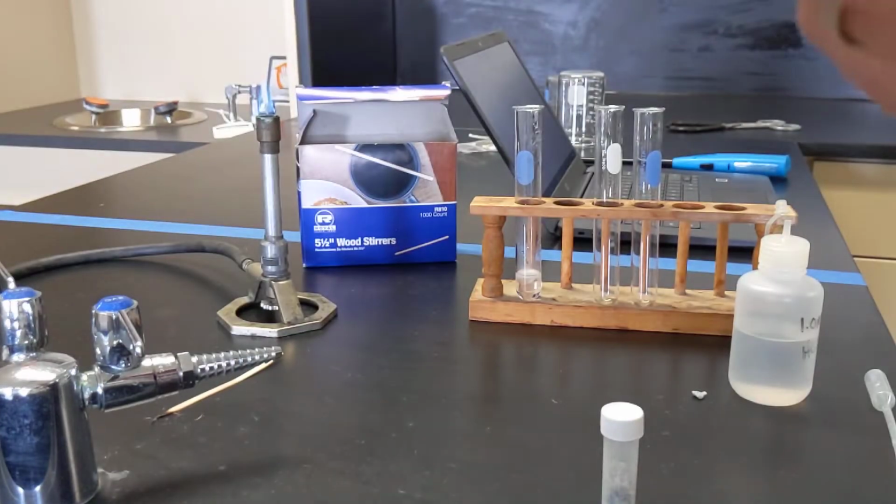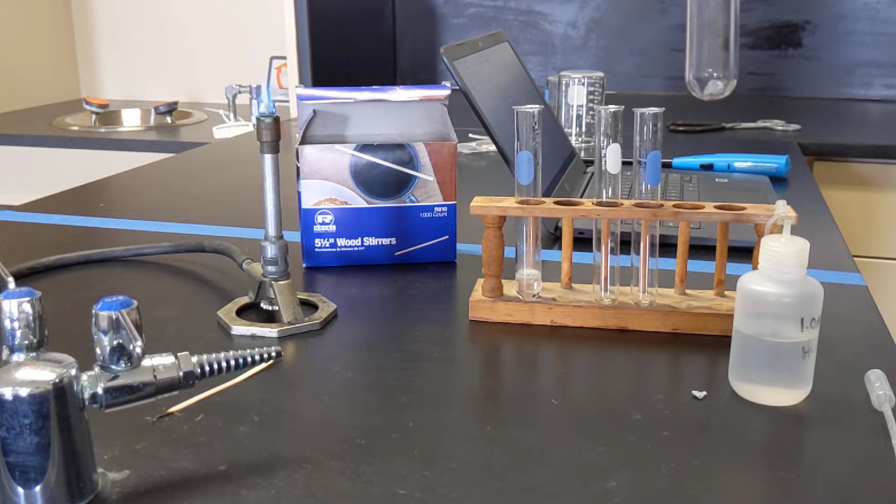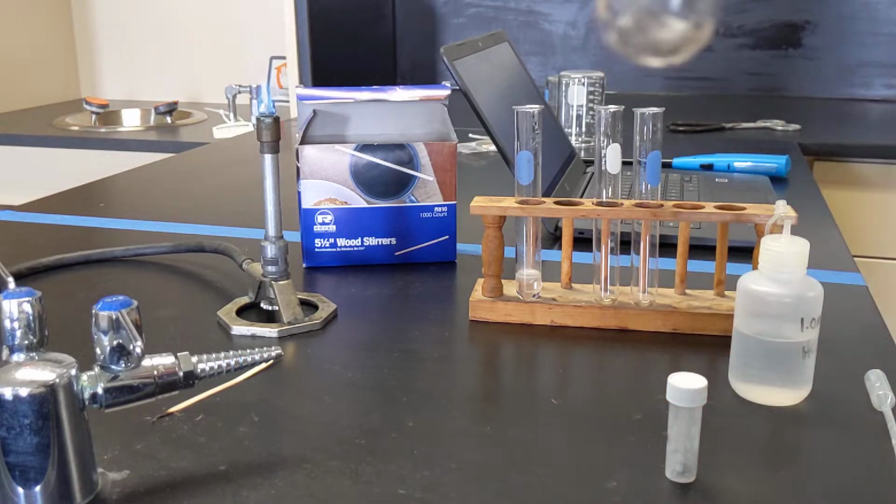But if you were to scrape that white coating away, which I might be able to do with my fingernail, it's not quite as shiny as you would expect a metal to be. It's a little bit dull. Zinc is an interesting metal. So I'm going to put a couple pieces in here just to make sure we see what we're supposed to see. A couple pieces at the bottom of that test tube.